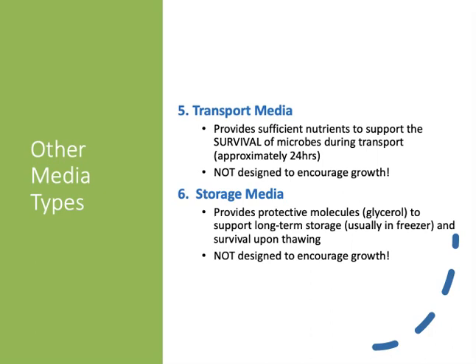Transport media, like the name suggests, is designed for the transport of microorganisms from one location to another. Transport media provides just enough nutrients to support the survival of bacteria during transport. It provides for about 24 hours.